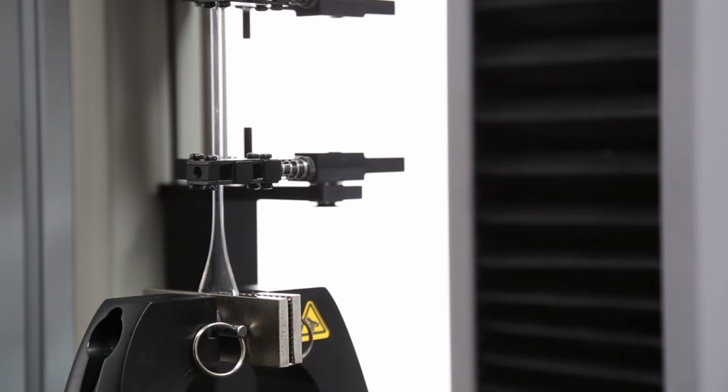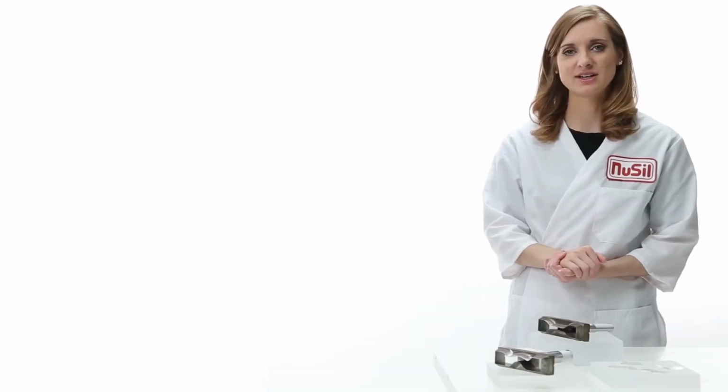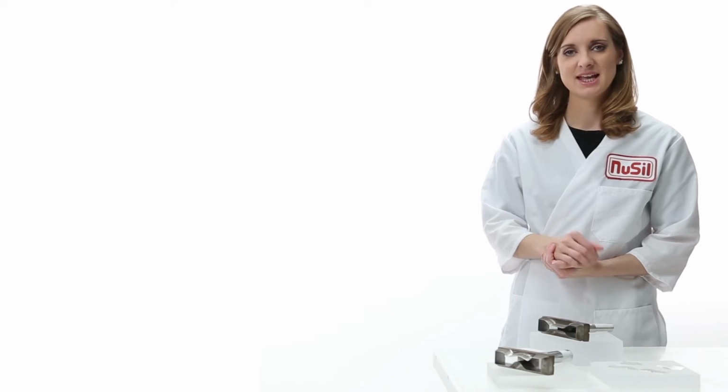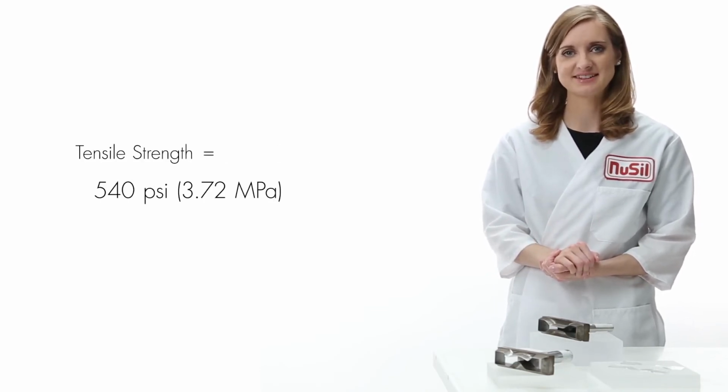The force required to stretch the material increases as the sample is stretched. The force at that exact moment that the sample breaks is reported as the tensile strength. In this case, our sample has a tensile strength of 540 psi.